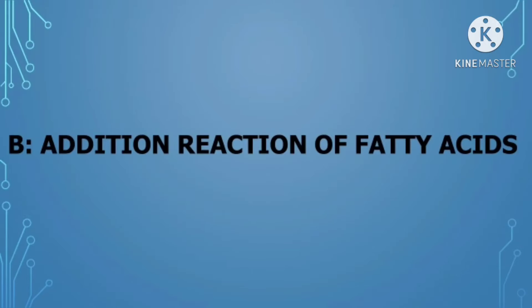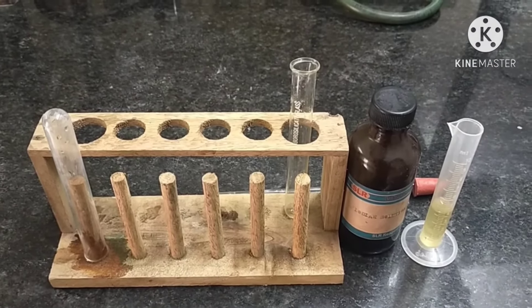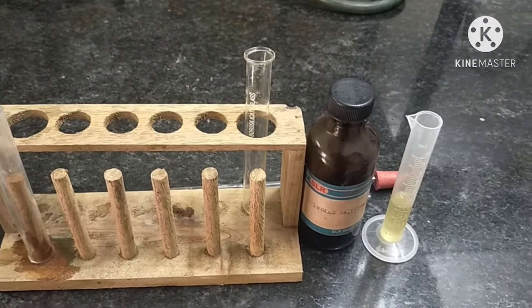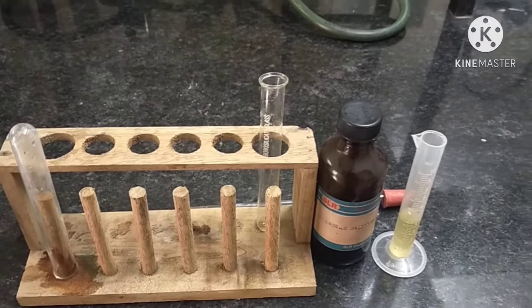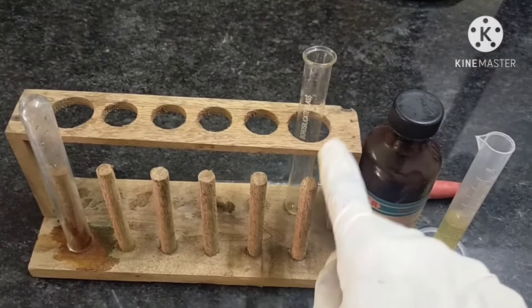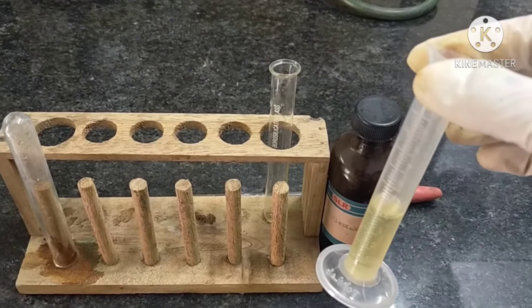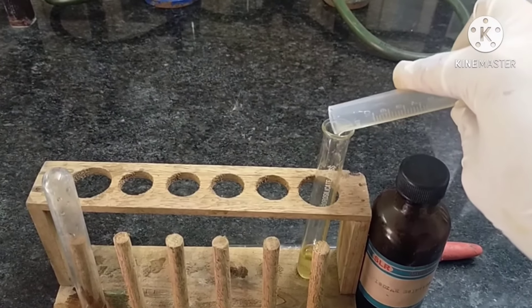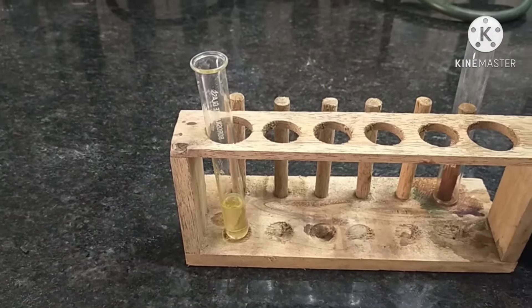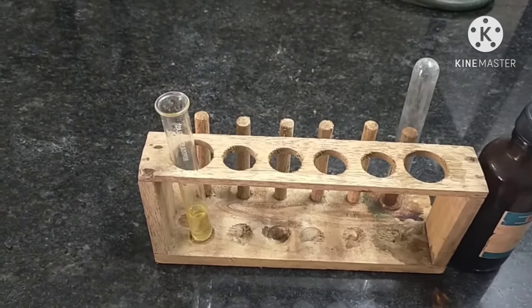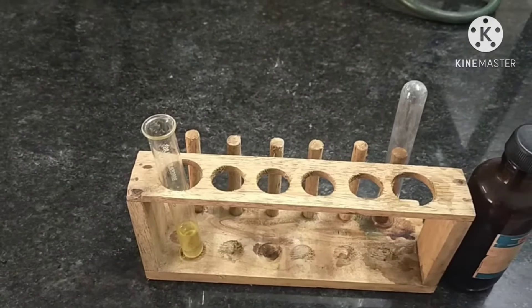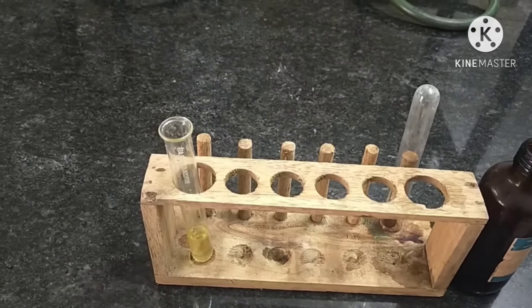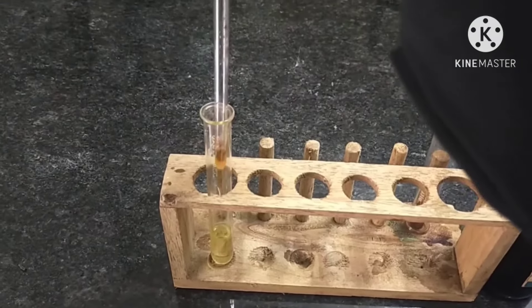Let's move on to the next test: addition reaction of fatty acid. To perform this experiment we require different types of oil — here I take groundnut oil — and also iodine solution. Take one dry test tube, add 2-3 ml of oil measured in the measuring cylinder, and pour it into the test tube. Now add iodine solution using a dropper like this.